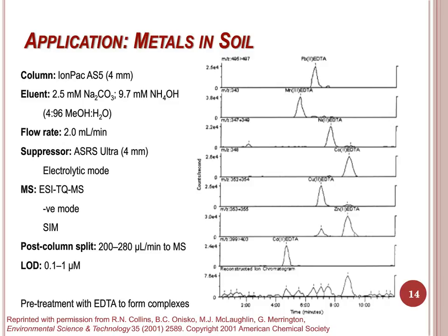Although it was possible to detect [M-2H]2- given an overall 2- charge, as well as corresponding fragment ions via losses of 1 or 2 carboxylic functional groups from the EDTA molecule. Given the structure of EDTA, positive mode ESI-MS was also possible, though negative ionization mode offered better detection limits in the low sub-micromolar range for manganese, zinc, aluminium, cadmium, and copper EDTA complexes. This shows the separation of a 50 micromolar standard, and the authors then went on to study soil solution and xylem exudate samples.